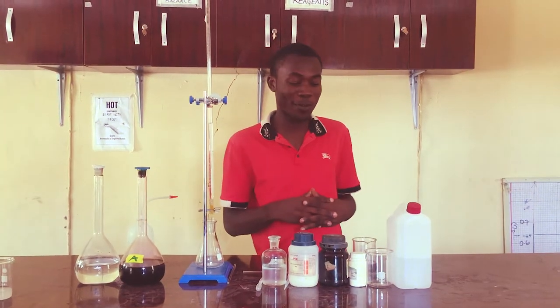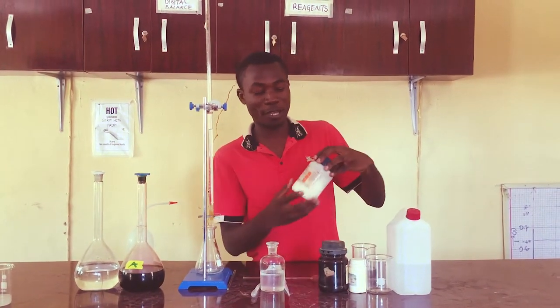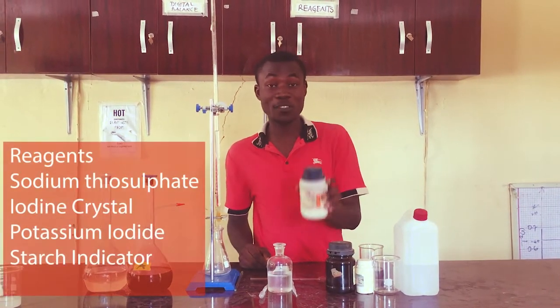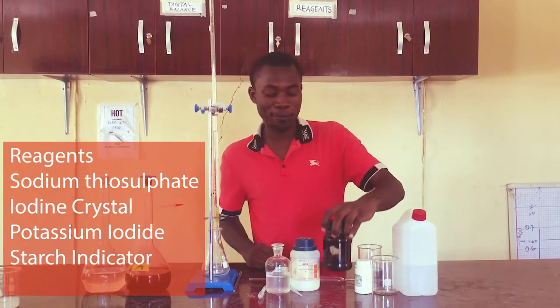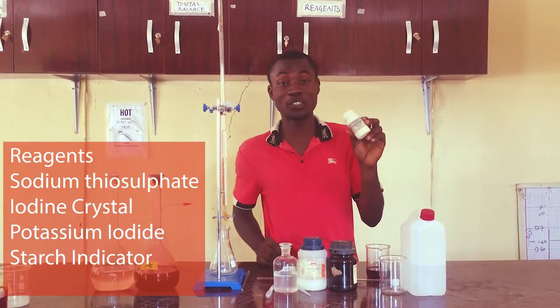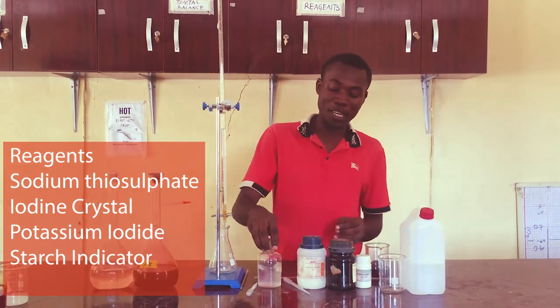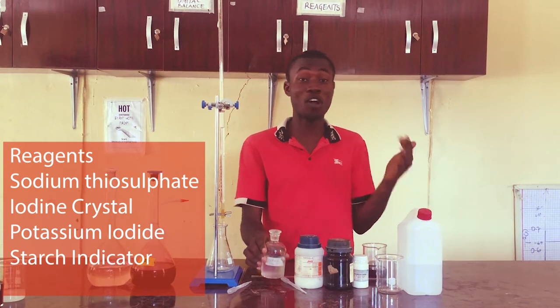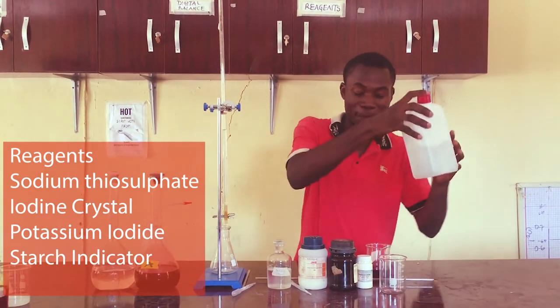For the practical we require the following chemicals. We need sodium thiosulfate, which is Na2S2O3. We also need iodine crystals — it is a bit poisonous and irritating to the eye. We also have potassium iodide, which is also required for the titration. We need soluble starch, dissolved in water and boiled for about 2-3 minutes. We also need distilled water.